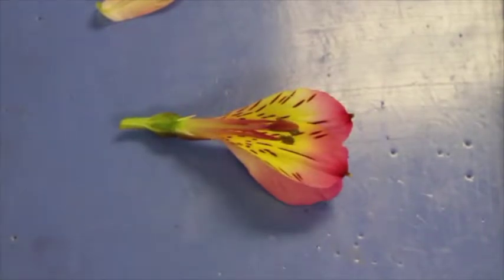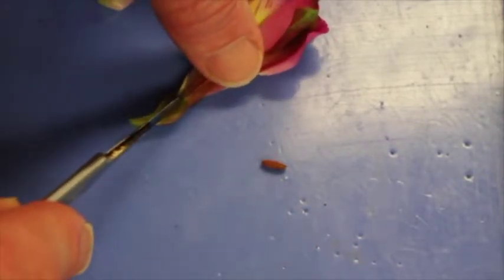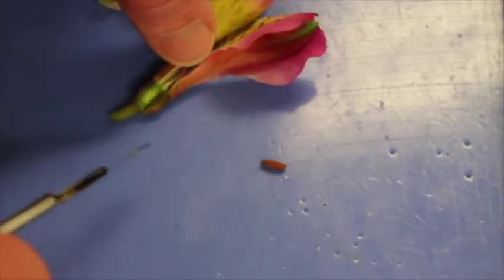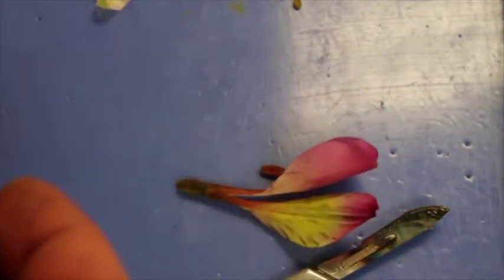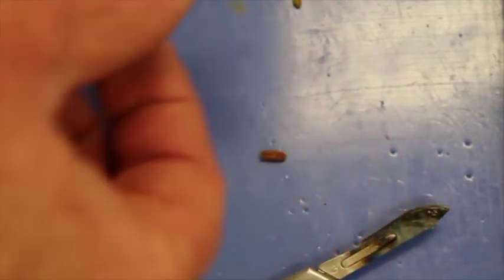Now what I'm going to do is take a section down through the ovary. So here's the ovary. Right here, I want to cut right down the middle of that ovary. Okay. And I have two parts, and we'll examine all of these individual parts with the dissecting scope.